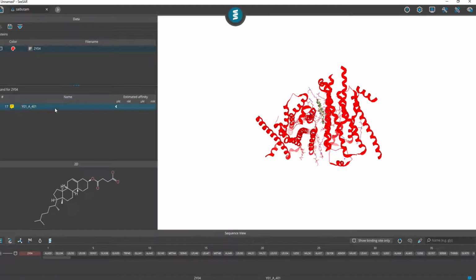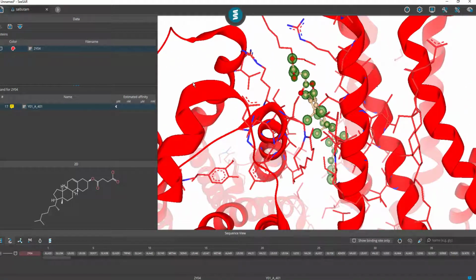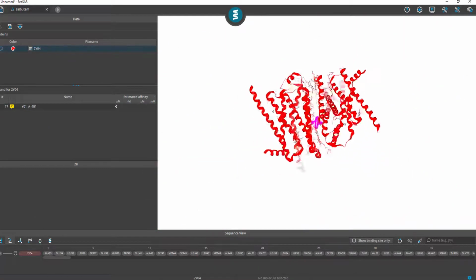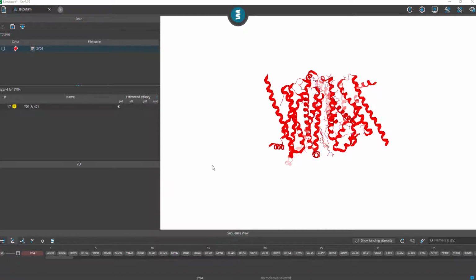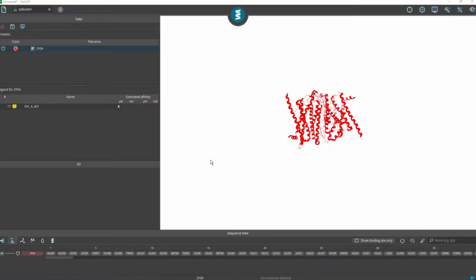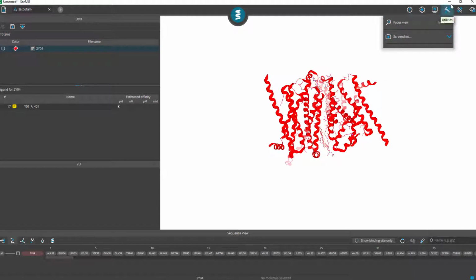So yeah, select the ligand, hit the spacebar, have a close-up and centered and focused look of the ligand, deselect, hit the protein, bam, you have the protein right in the middle of the screen. Maybe just one final point to note about the focus view option is that it can also be activated from the menu up here. So you see the utilities button over here, click on that and hit focus view, and you get the same action essentially as what this spacebar does.